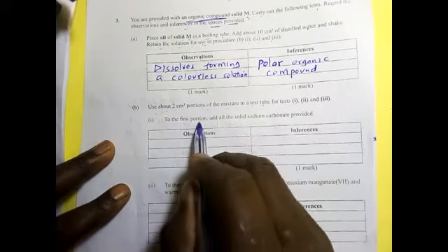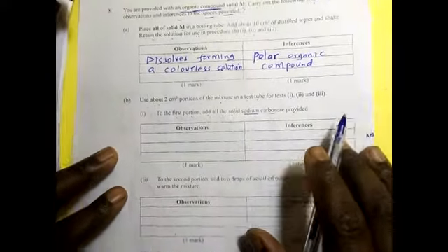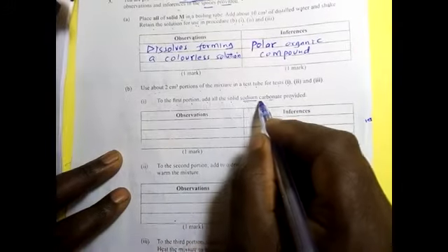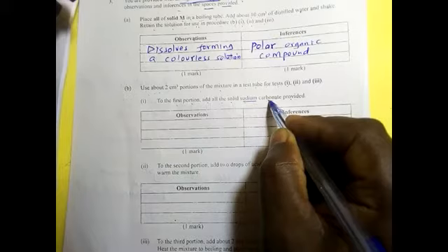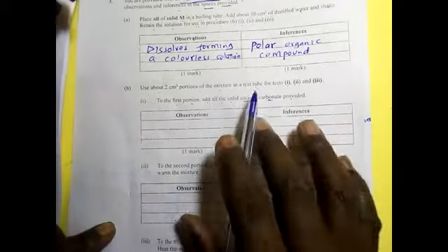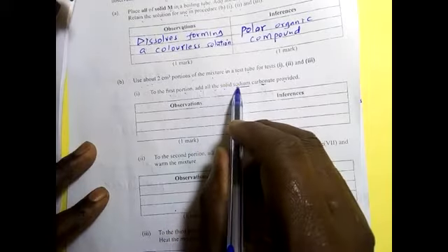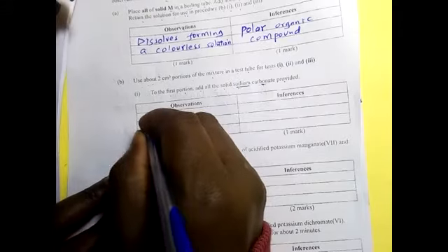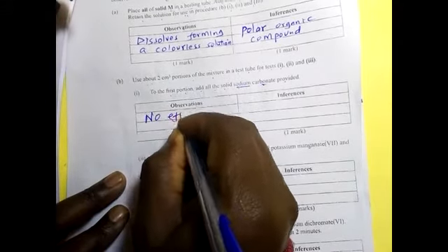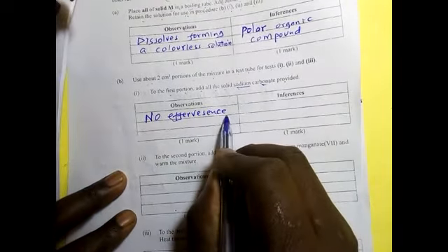So, to the first portion, add all solid sodium carbonate provided. I have always told you that whenever you are adding sodium carbonate, this is a carbonate. If the solution is an acid, you will expect effervescence. If the solution is not an acid, you will not see effervescence. So here, solid carbonate, you expect effervescence or no effervescence. In this case, there was no effervescence.